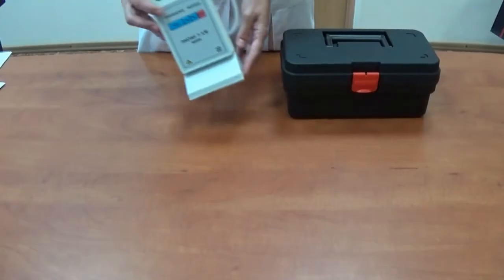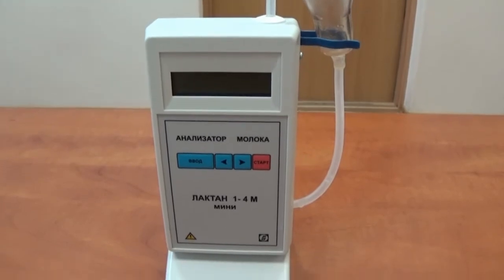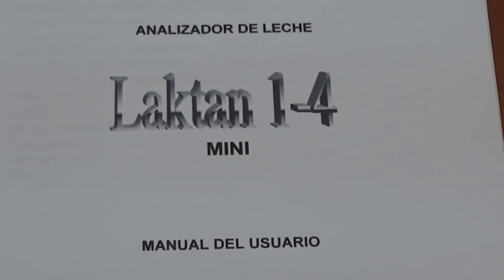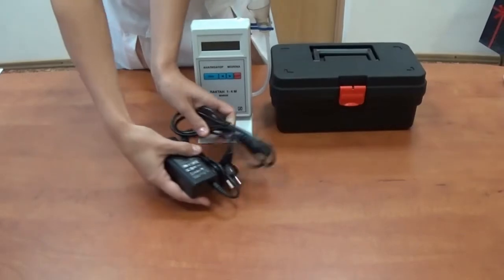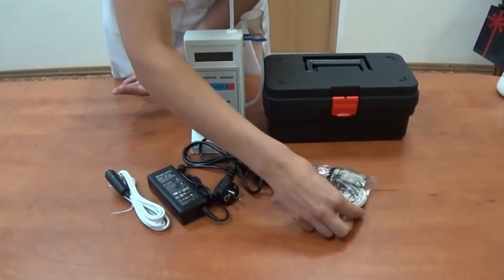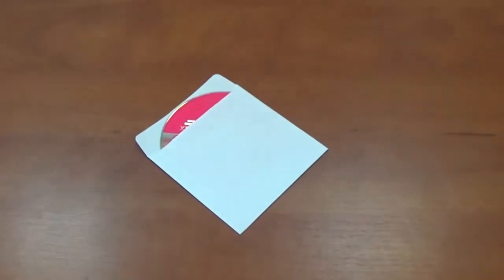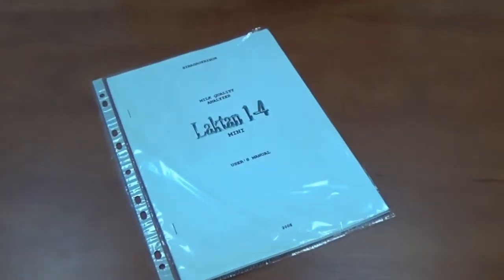After receiving the milk analyzer from the manufacturer or warehouse, we recommend making sure that the packing is intact. After unpacking, check the completeness of delivery according to the packing list and check the analyzer externally for safety seals and absence of mechanical damages. The complete set includes: a plastic carrying case, the milk analyzer with desk stand, power supply and power cable, a cable for 12-volt car battery, a null modem RS232 cable for computer attachment, a syringe for cleaning, a user's manual in English or Spanish, a CD containing software and user's manual, and a set of cleaning reagents N1 (daily) and N2 (weekly).